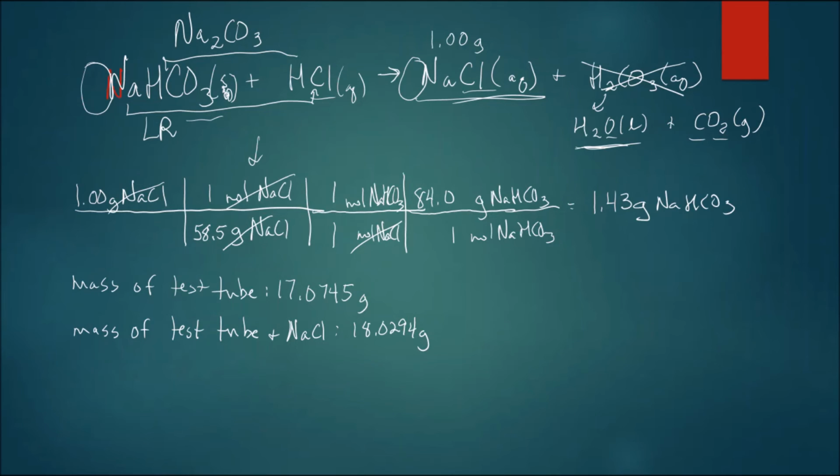So what are the results of this experiment? Did we get our 1.00 grams? Well, it does not appear that we did. We did get quite a bit, and we can discuss the reasons why we did not get exactly 1.00 grams here in a second. First of all, how much did we get?